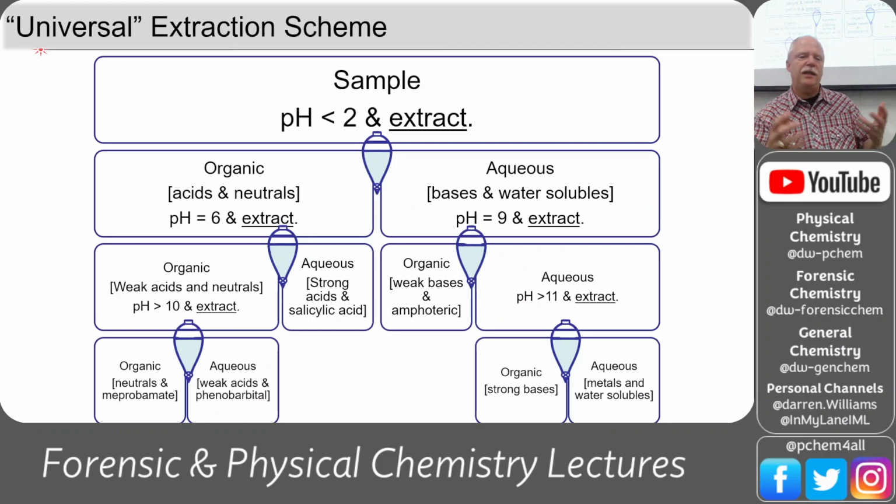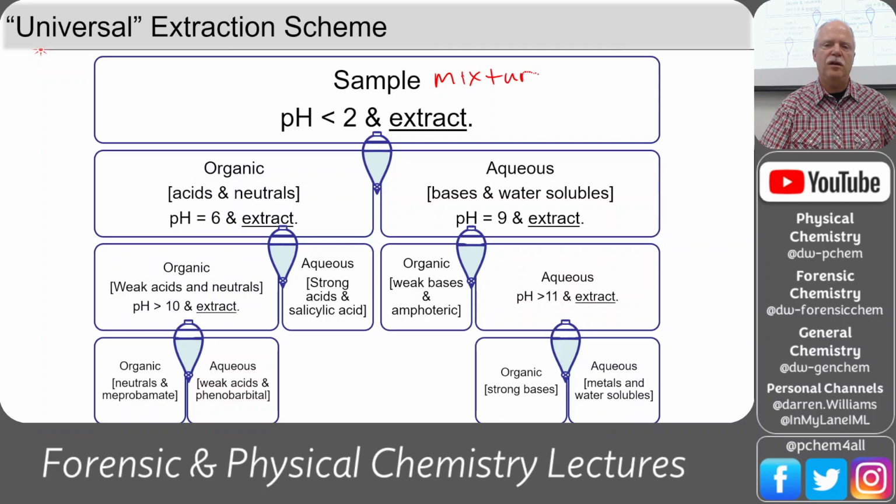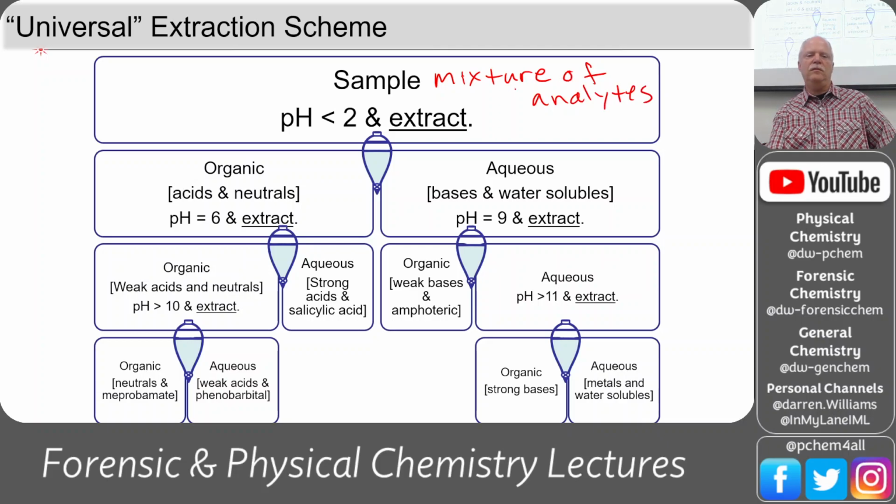So here's a universal extraction scheme. If we have an unknown mixture, some sort of powder, and we want to separate all of these different things, these are the classes of extracts that we would get. So we could just take this unknown sample mixture and pick our favorite organic phase. Chloroform may not be your favorite. Maybe it's ethyl acetate or something like that. And we adjust the pH of the aqueous layer to less than 2. So we put maybe some hydrochloric acid in there and dissolve that sample.